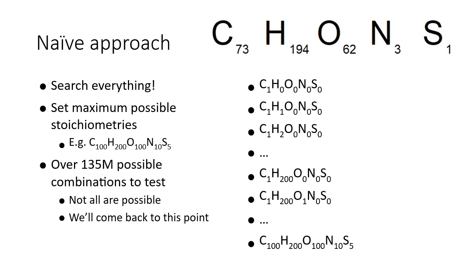Let's say, for example, up to 100 carbons, 200 hydrogens, 100 oxygens, 10 nitrogens, and 5 sulfurs.